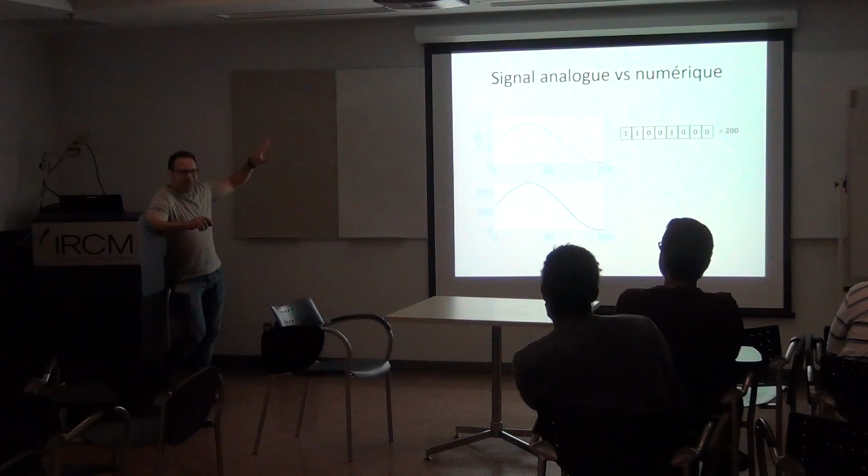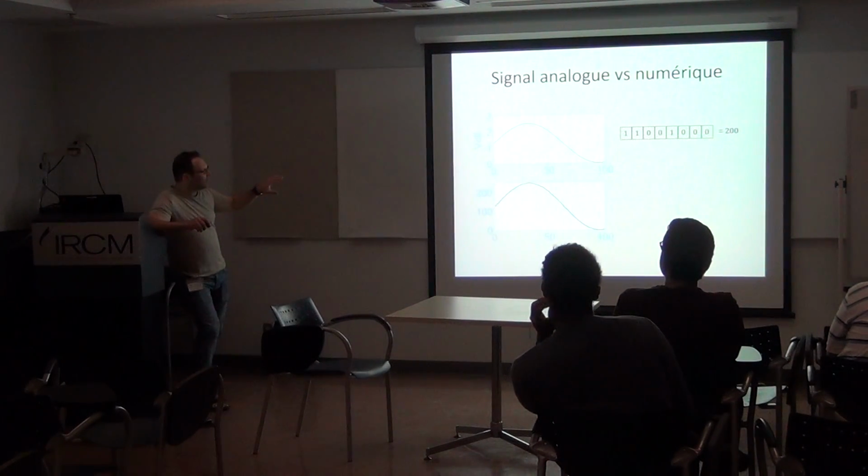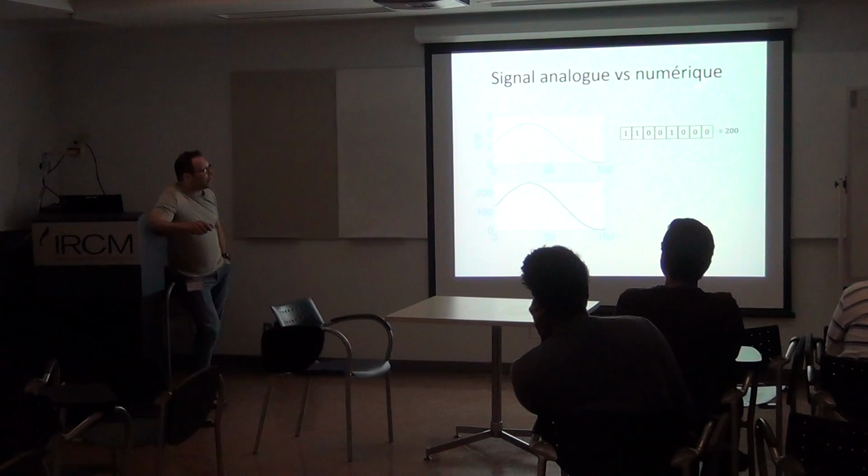There is always something analog in it, and then you need a digital converter. That is basically what you use. If you have a really nice digital converter, then you're going to be able to distinguish.